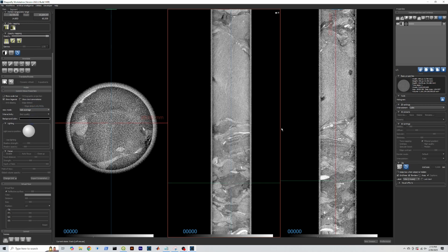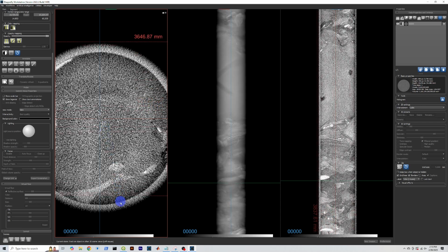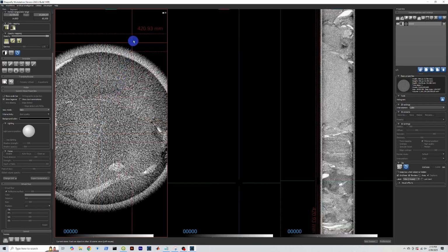And you can see already some of that speckle noise has been removed, but we can go in, sort of drive using the XY plane, and we can make the region which it's averaging over thicker. And as you can see, as you do that, you start to get a sort of mushier image in the center here. So we'll choose a width of about 1 centimeter. And again, because I did not set our XYZ resolution, that's like some crazy number that's not actually realistic. Okay, cool. And if I wanted to steer through this XZ plane, what I would often do is just click and drag on the XY and move that set of crosshairs.